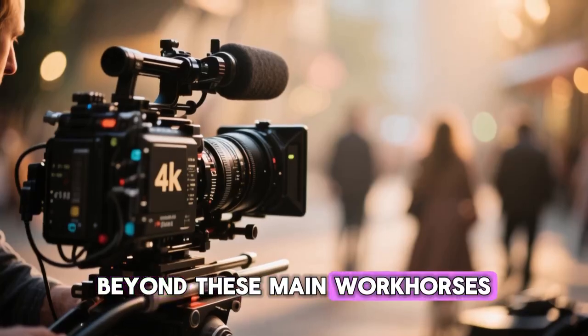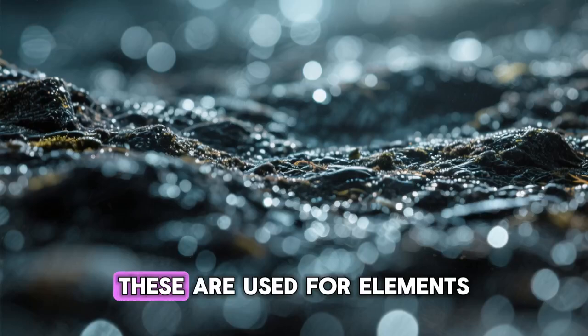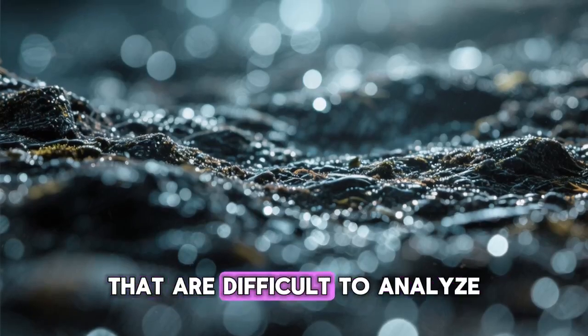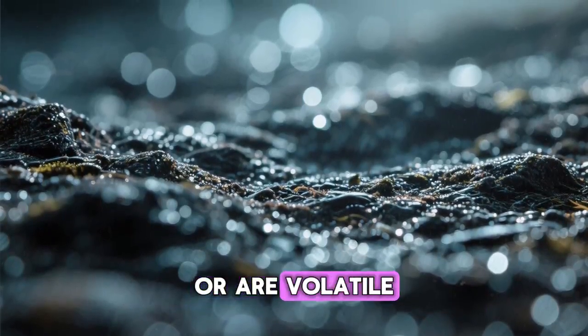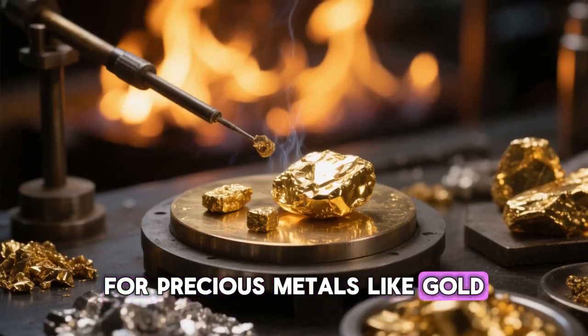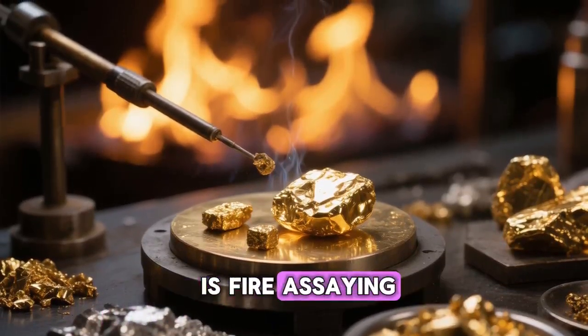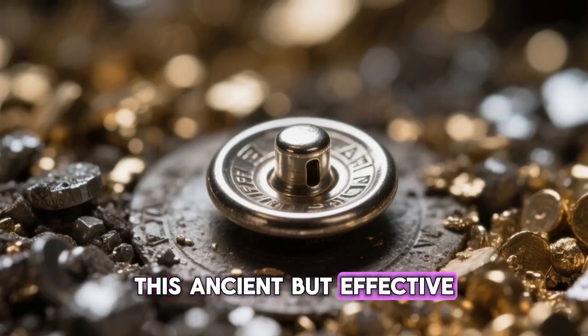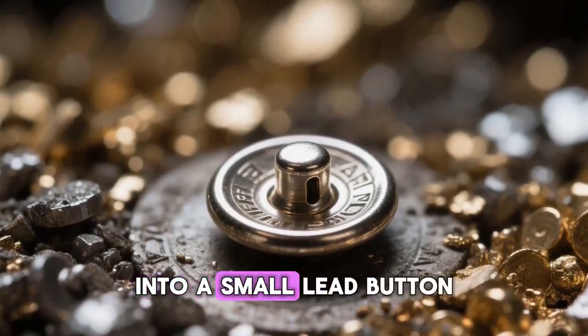Beyond these main workhorses, there are several specialized and complementary methods. These are used for elements that are difficult to analyze, are distributed unevenly in the sample, or are volatile. For precious metals like gold and the platinum group elements, the gold standard method is fire assaying. This ancient but effective process concentrates the noble metals from a large sample into a small lead button.